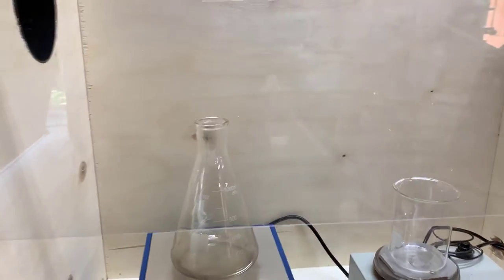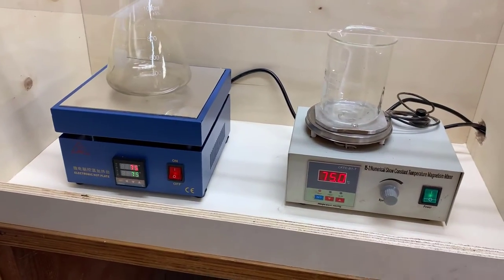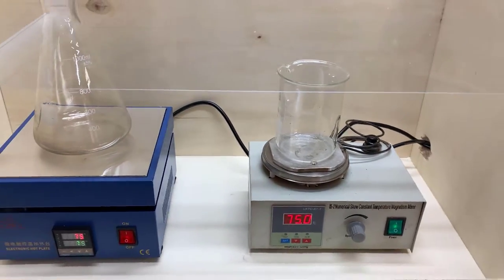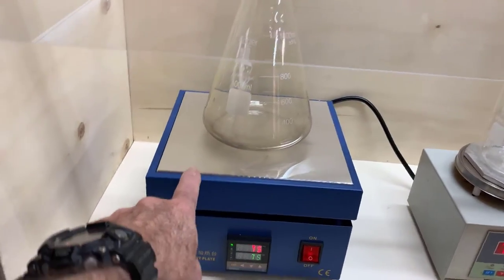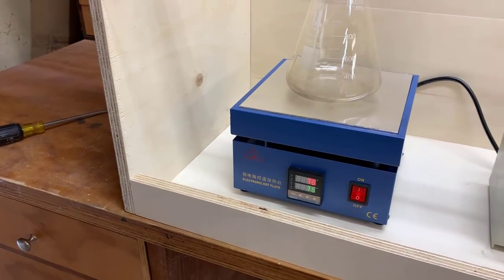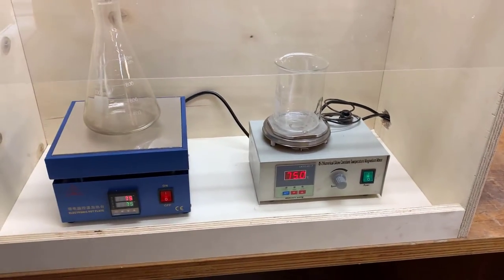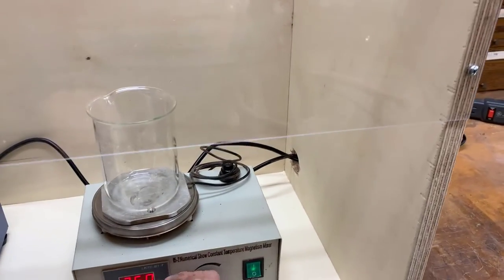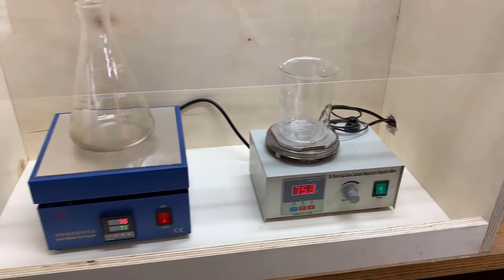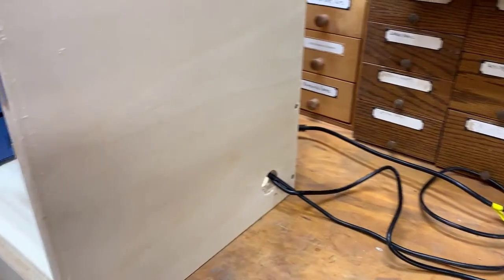And that, you can see, is plenty big enough. Right now I've got two hot plates in here. This one has a stirrer, and this one is just a hot plate. The temperature can be independently set on each one. And this has a magnetic stir bar, which is quite convenient for some applications. The cords come out a little mouse hole in the bottom.